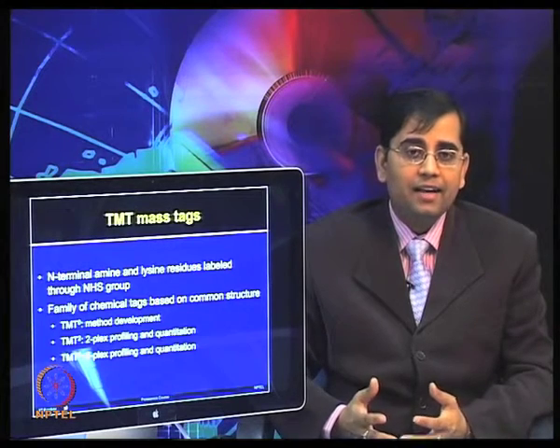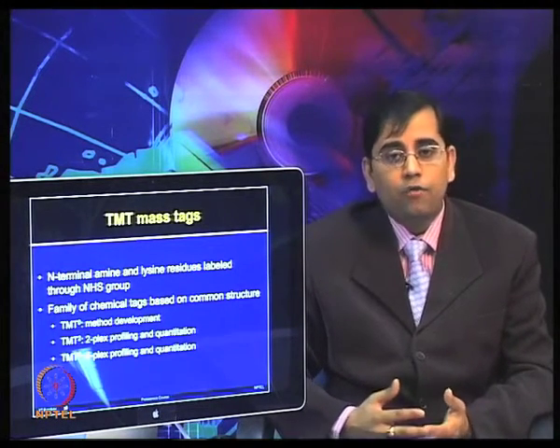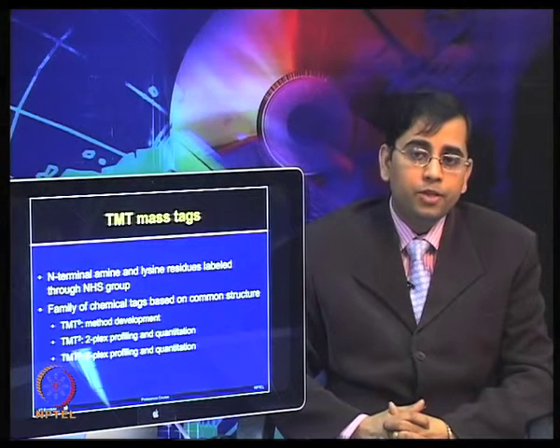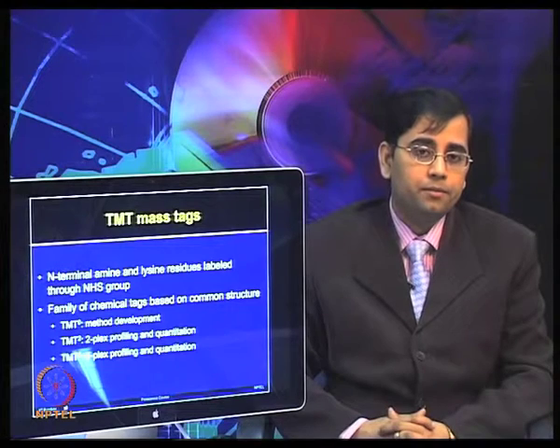While duplex and 6plex TMT labels differ by the number of isotopic substitutions, the TMT 0 is a non-isotopically substituted structure that has been produced only for method development.